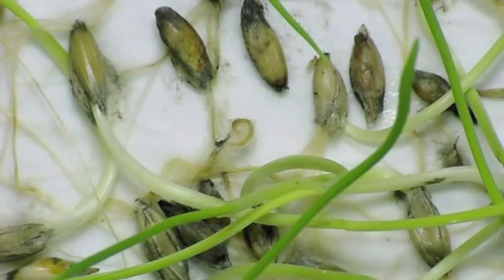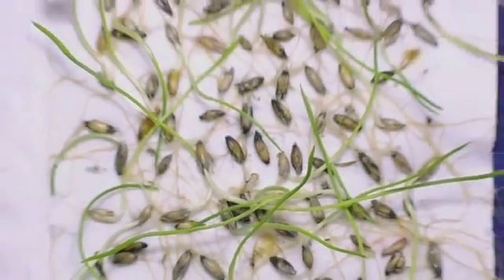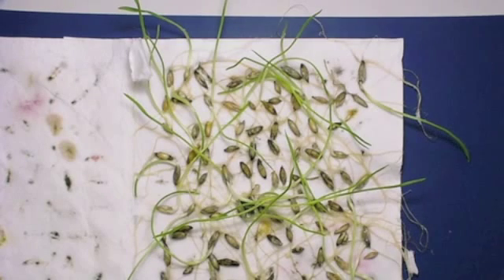Zooming out again just to show you how the frost has impacted this particular germination sample, we see that only about 30 to 40 percent of these seedlings have actually survived, and a good 50 to 60 percent have been affected completely by frost.